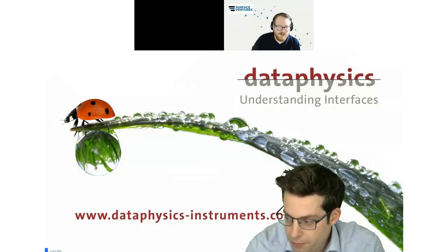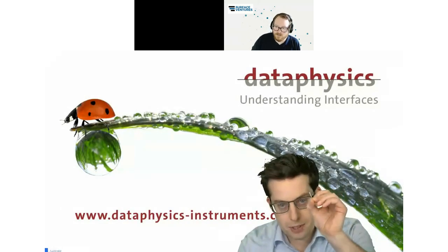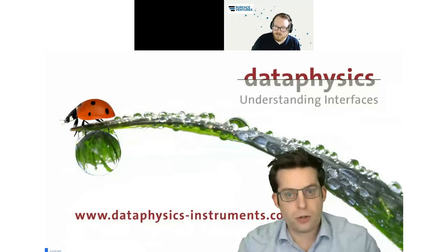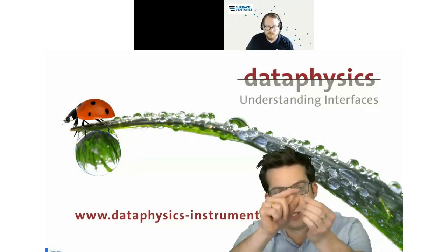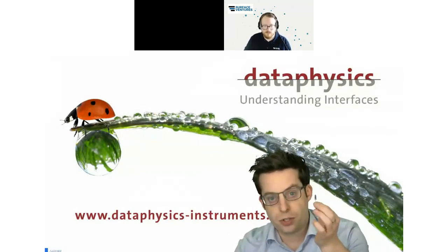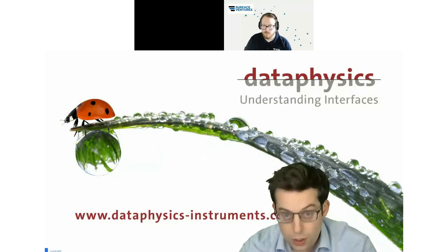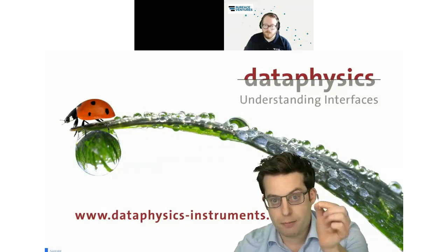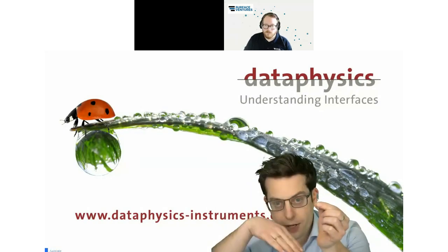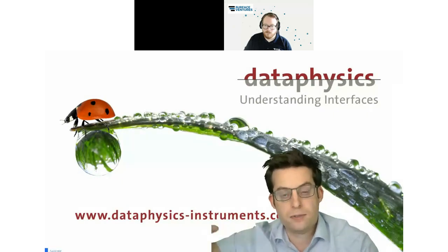So maybe I comment a little bit on this. In general, if the geometry of your sample is very well defined, you can also compare different geometries with each other. However, for the implant, we have these screw turnings on the surface, which also have a little effect. So what I would do is only compare the exact same geometry of the implant, coat them in different ways, and then you can compare the imaginary contact angles with each other very well.